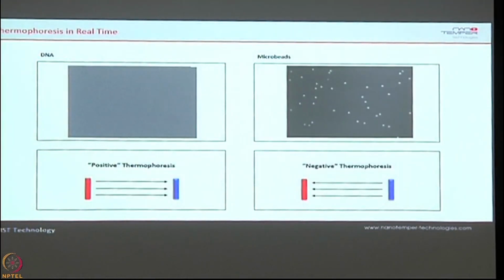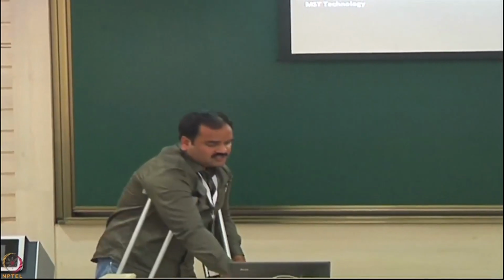Generally, as I said, with thermophoresis, the moment you put in heat, all the molecules move away from the heat. That is a general principle. As you can see here, this is just a cover slip slide which has been coated with the LMU logo. The moment you shine a laser, all the fluorescent molecules move away. That's the reason why you are able to see the LMU. This is Munich University. That is called positive thermophoresis: the molecules moving away from the heat, which is a general property.